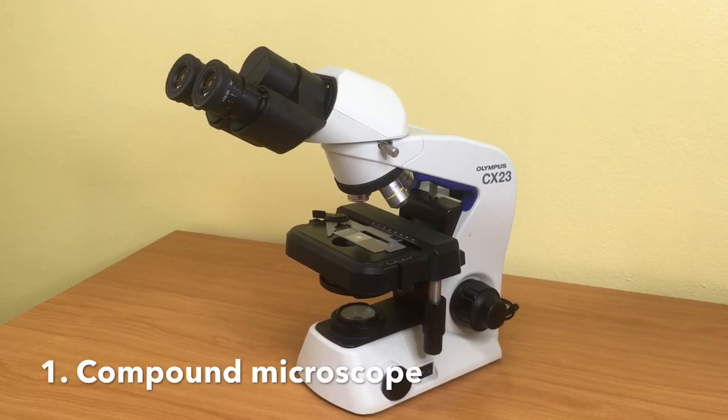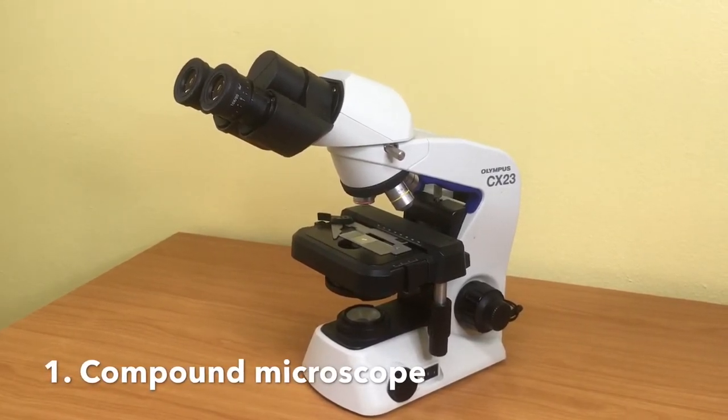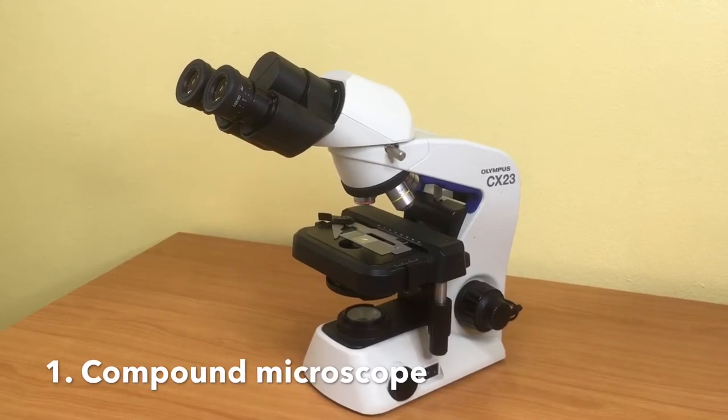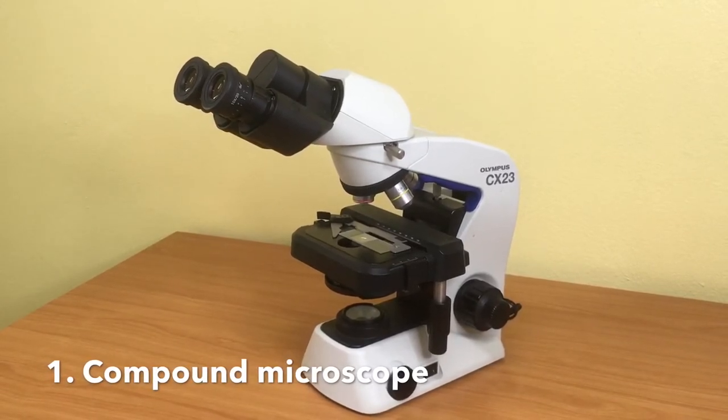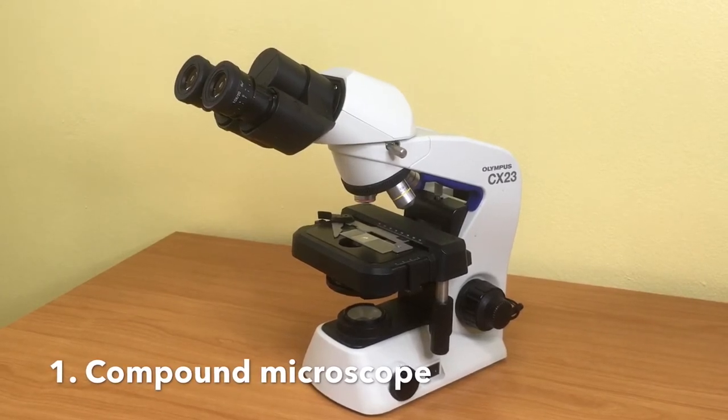In this lab, you will learn two types of optical microscopes. The first one is a transmitted compound microscope, or we call in short a compound microscope.